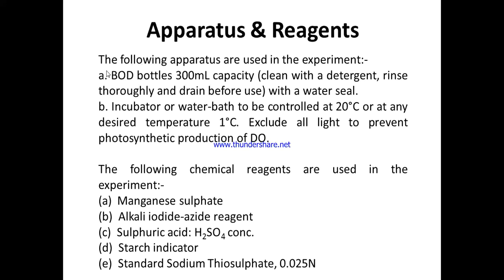Basically we will need a BOD bottle, okay, we will need a BOD bottle of 300 ml कैपेसिटी. BOD बॉटल जो है नॉर्मल जो हमारा फ्लास्क वगैरह होता है उसी तरफ का देखने में. I'll show you in the experiment in the video. So BOD bottle has a capacity of 300 milliliter.